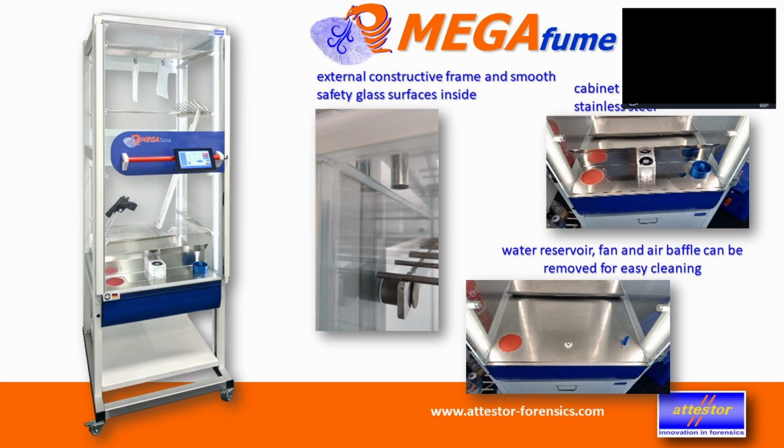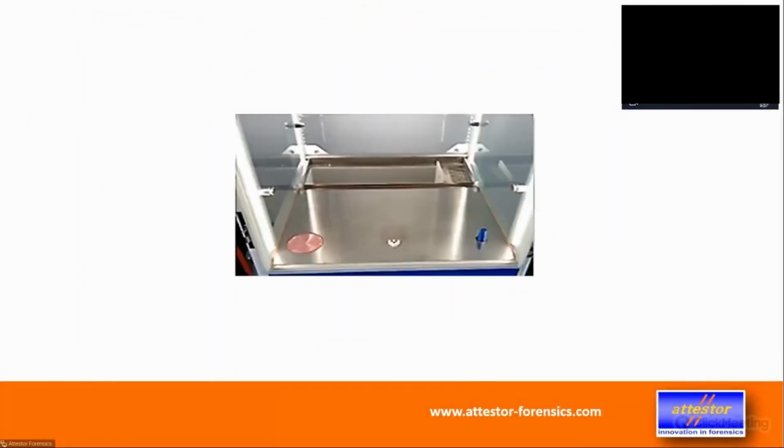Then in the center, there will be, again, pictures where you see it a bit better, but in the center you see on the upper picture a fan. That's a circulation fan that moves the air inside the cabinet, and also that one can be just unplugged without any tools. And then you have basically an even surface all the way to the back, which is super easy to clean again. So that much about the constructive measures to make it easier to clean the system.